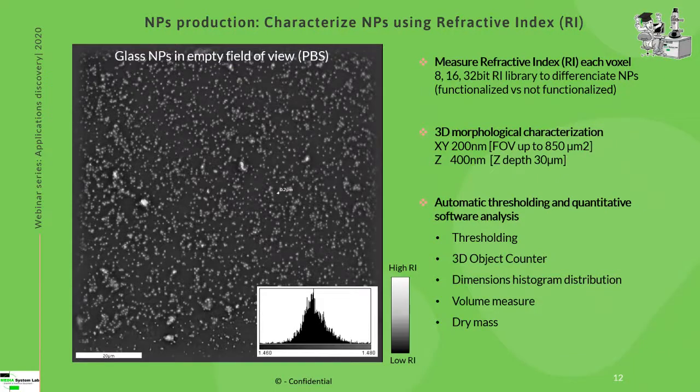So let's see the first application that I want to introduce, which responds to questions like: are my nanoparticles for my study correct? Is this the right choice? Are my nanoparticles appropriate, with the correct features for the study that I'm going to do? That is a fundamental question that we should ask before going for a study that involves nanoparticles.